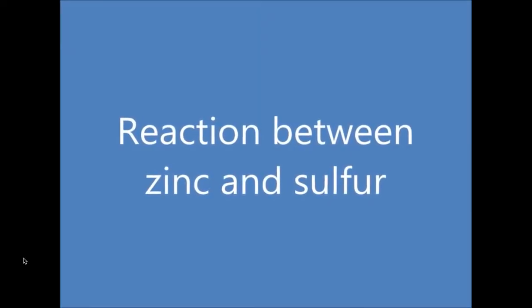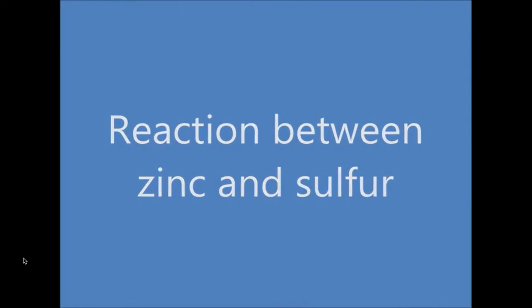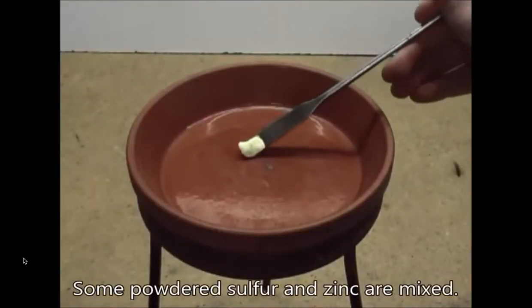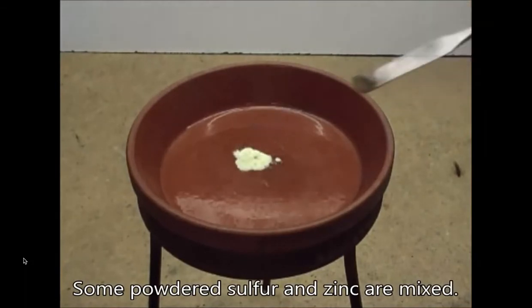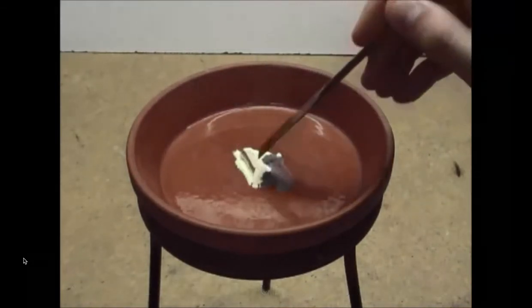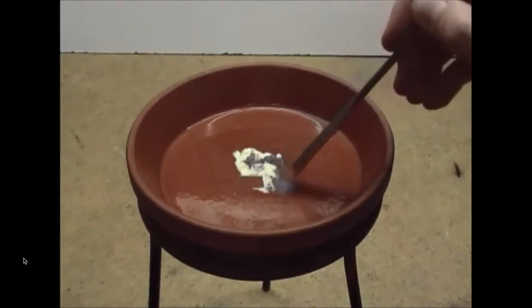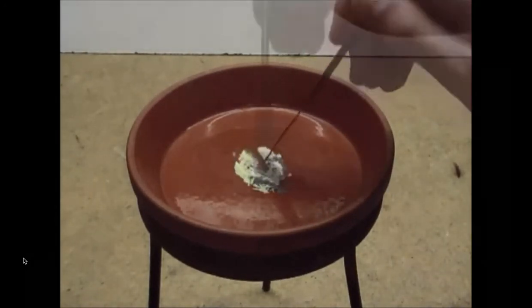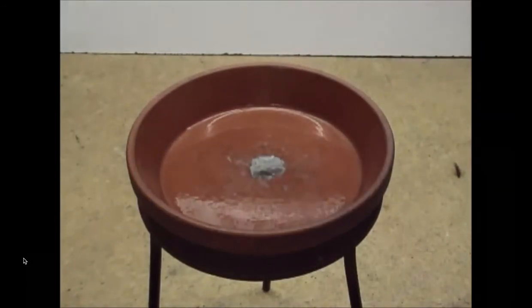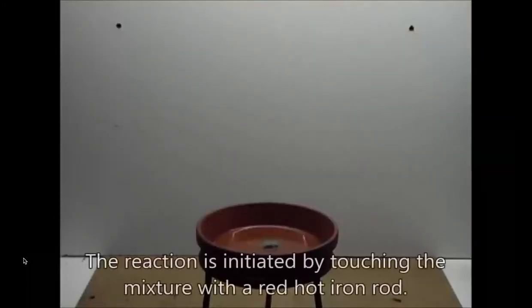We're going to look at the reaction between zinc and sulfur. Sulfur is a yellow powder and zinc is the more gray silver powder. What we're going to do is mix them together in a nice little pile and try to get them to form a new compound in a synthesis reaction here. We need to initiate this reaction with a red hot iron rod, or we could heat it up with a Bunsen burner.